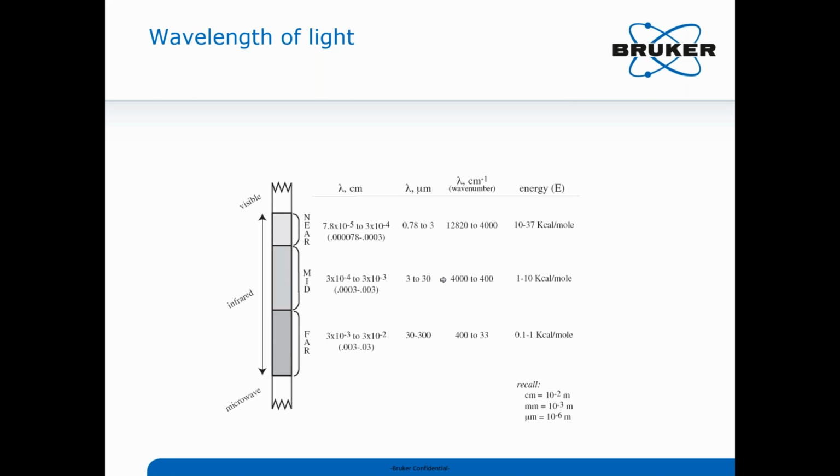In the near infrared, we're accessing higher order vibrational transitions, and those are less facile or less probable. So you have less sensitivity in the near infrared and less specificity. But because of those things, sometimes you can integrate over more matter. So if you're looking to quantify inhomogeneous things like grains or other things, because you're integrating more matter, the quantification accuracy can be better. When you look in the far-infrared, what information do you get there? That's where you get solid state modes or looking at polymorph differences. And you also can see organometallics.